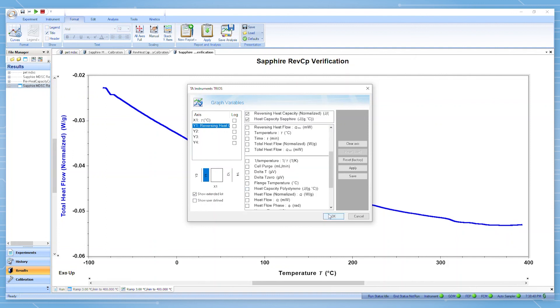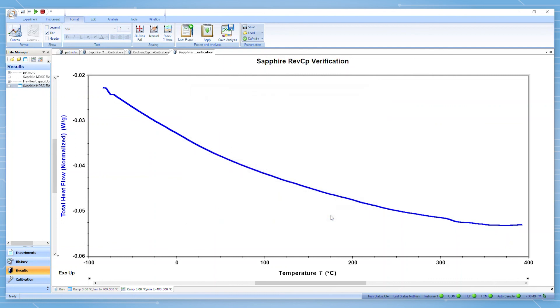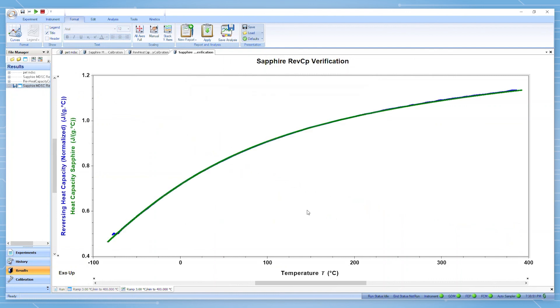You can then compare it to the experimental data. If there is a high degree of agreement, as observed here, then we can be confident that the instrument has a good calibration and that the reversing heat capacity from MDSC experiments should be trusted.